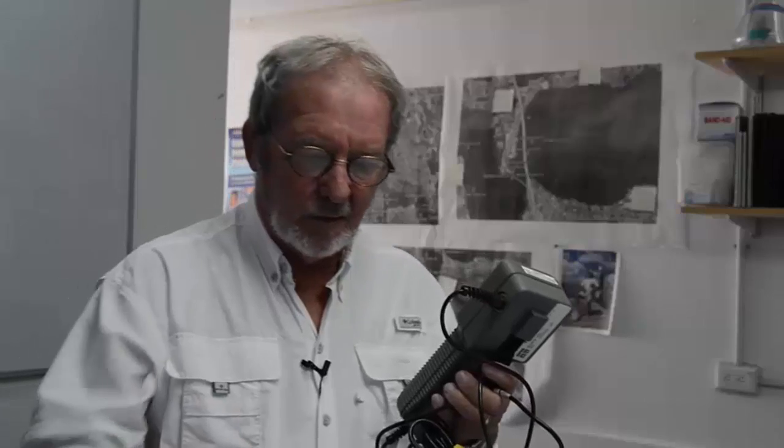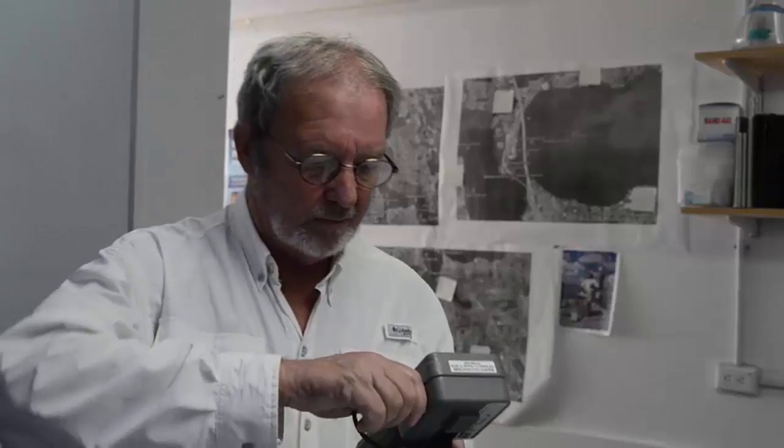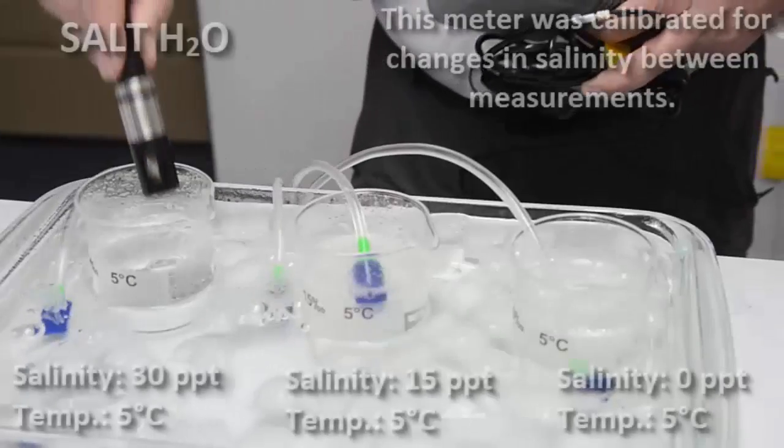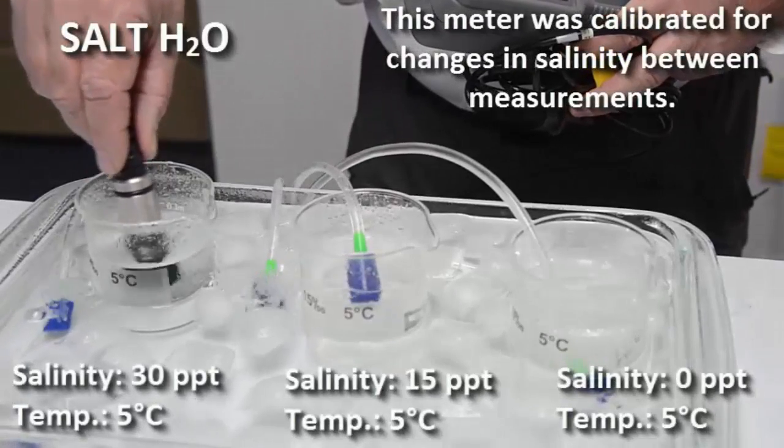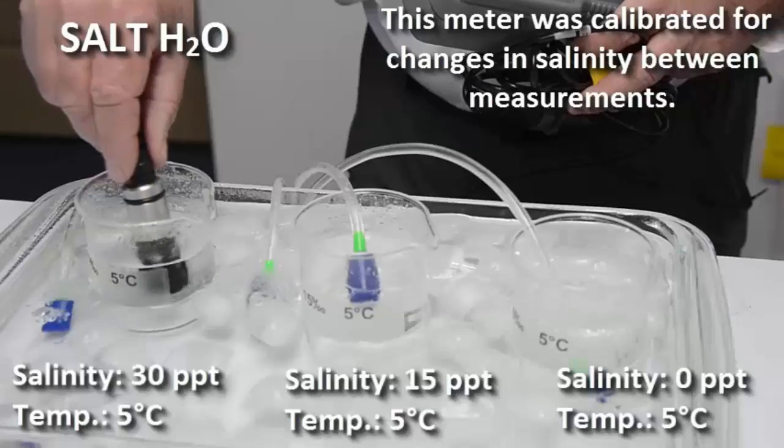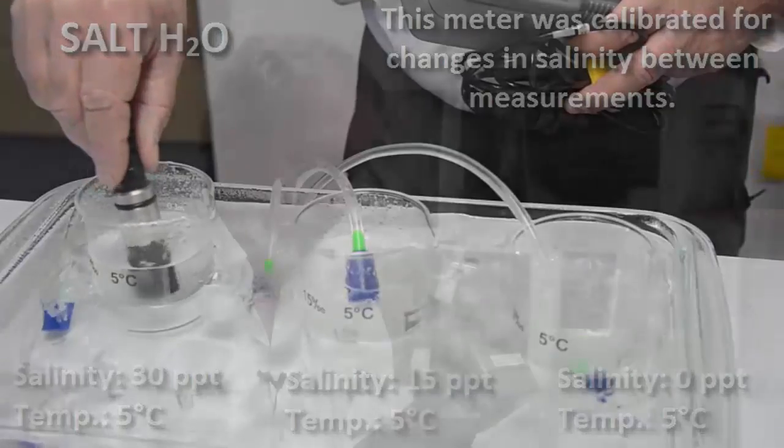Okay now we're going to look at full strength seawater or 30 parts per thousand salinity and a cold bath of five degrees centigrade. So now we've already done fresh water at five degrees centigrade. Now we're doing salt water at five degrees centigrade. 10.5.